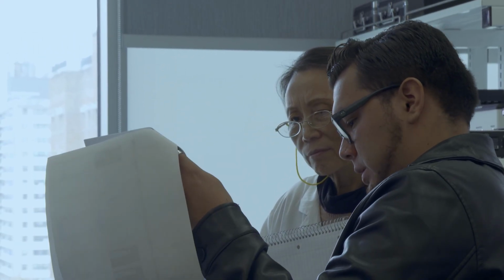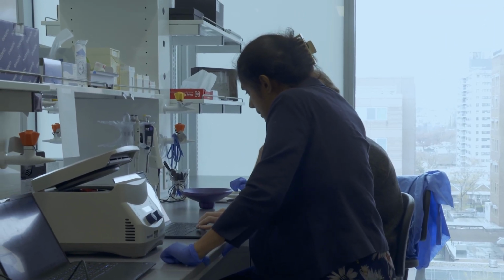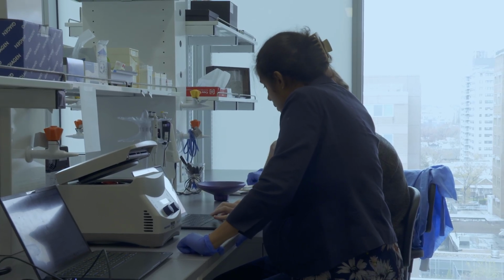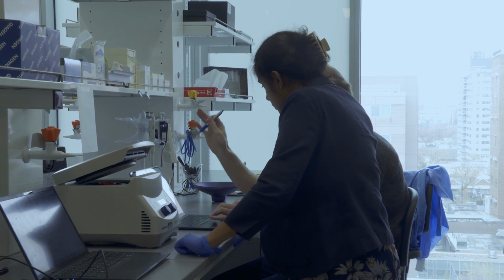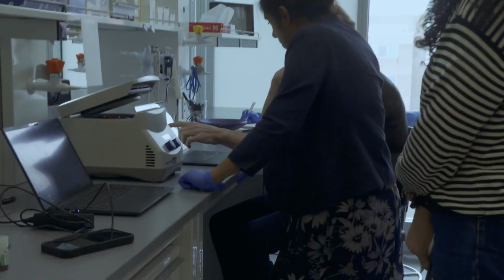So I guess the first question is to confirm I should be using the Qubit concentration. Yes, absolutely. Okay, great. So here's the Qubit concentrations. Here is the adjustable amount of DNA we want, in nanograms, and then here are the volumes that are calculated. Our thought was for the best one, number one, we would do 16 nanograms.